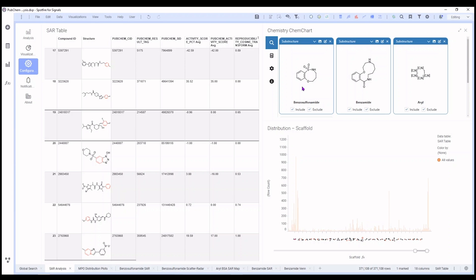So doing this, we've really been able to whittle down from a very large amount of data — remember we had 370,000 rows. We were able to identify some key chemical series and then start interrogating the data within those series to see things like which substituents are most favorable, which combinations have and have not been synthesized. And based on all that data, figure out where to move forward if you were using this as the starting point in a drug discovery campaign. I hope all this has been useful in showing how public data sets really do represent a treasure trove of information, if you just have the correct tools to unlock the detail and find the important patterns.